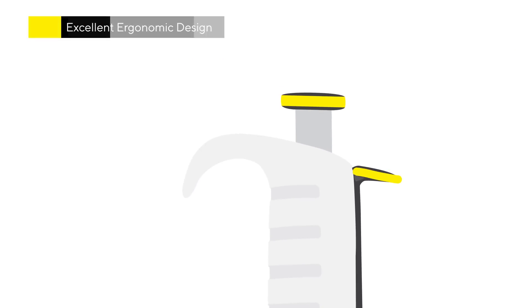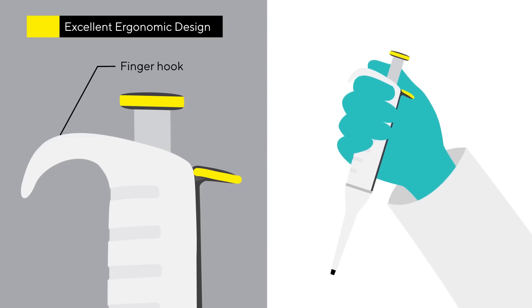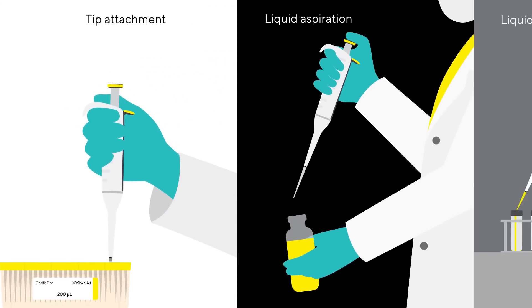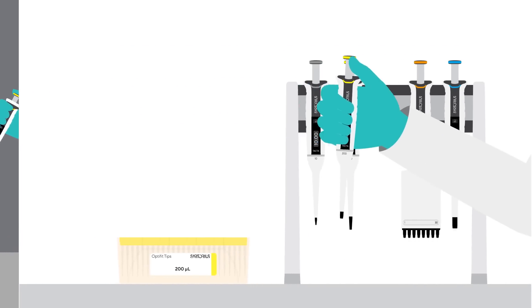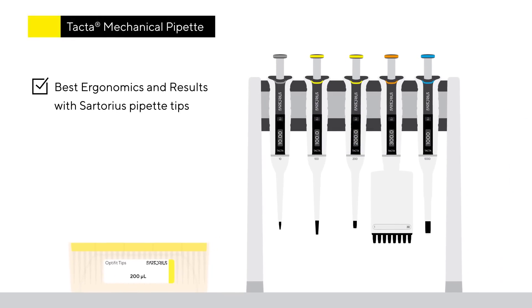Thanks to the ergonomically designed handle and finger hook, TACTA fits comfortably into all sizes of hands. The forces needed for a pipetting cycle — from tip attachment to pipetting and finally tip ejection — are exceptionally low with TACTA. Combined with Sartorius pipette tips, TACTA forms a complete system guaranteeing the best ergonomics and results.